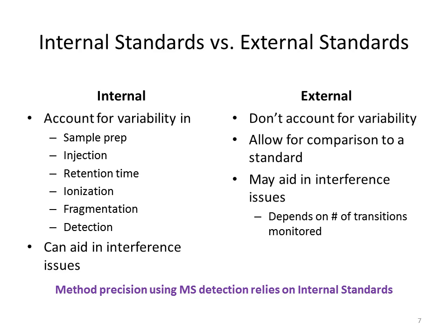So an example for these types of analyses of an external standard would be, if you don't have access to a heavy internal standard for your peptide, let's just say your peptide is detectable in plasma, and you're looking to detect it in plasma.